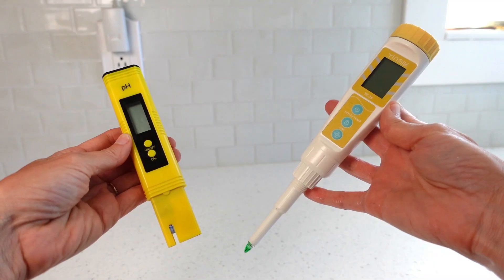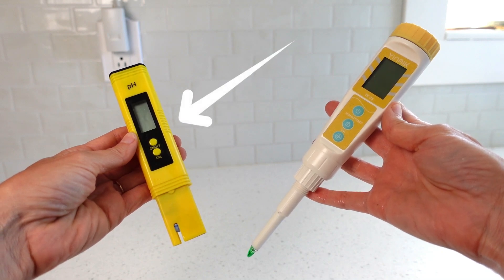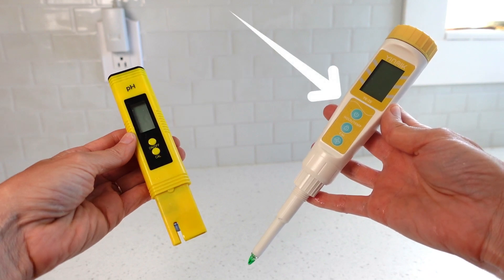First I will compare the two digital meters before integrating the pH paper test strips. The all-yellow one on the left I'll refer to as the basic pH meter, and the yellow and white one on the right I will refer to as the upgrade pH meter.